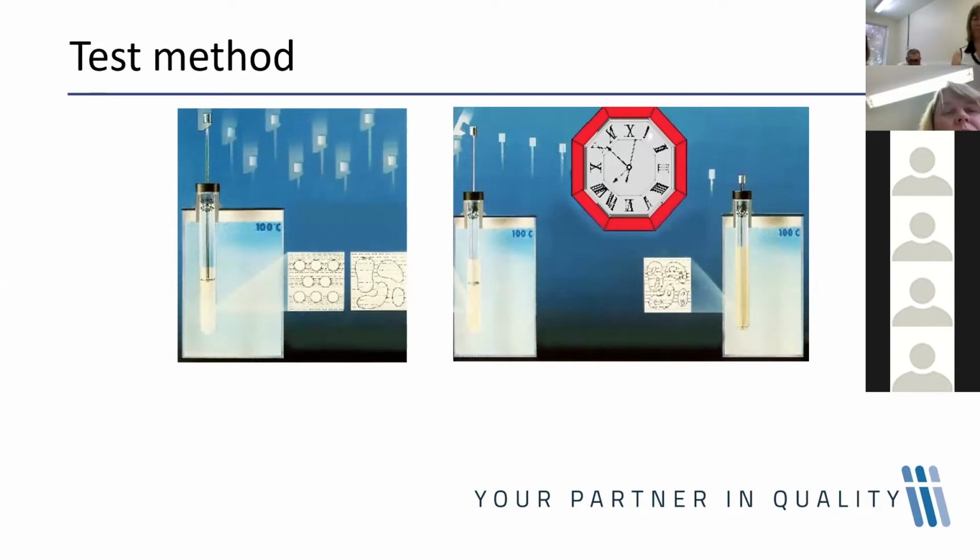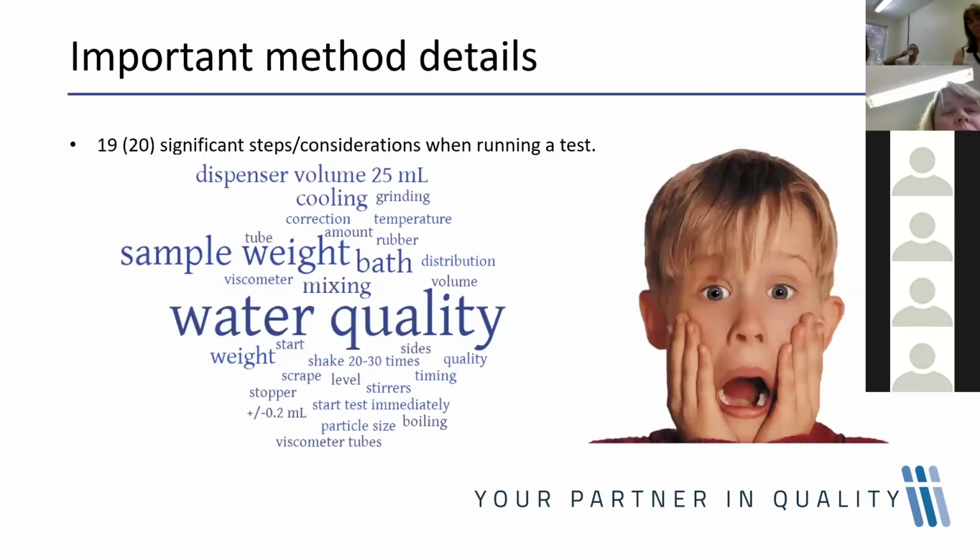After 5 seconds, the instrument hook is going to pick up the stirrer and stirs the sample for 60 seconds. Thereafter, the instrument releases the stirrer after exactly 60 seconds and allows the stirrer to drop through the pasted slurry by its own weight. The falling number is then established as the time it takes for the stirrer to drop from the top position to the bottom, and this also includes the initial 5-second wait as well as the 60-second stirring time.